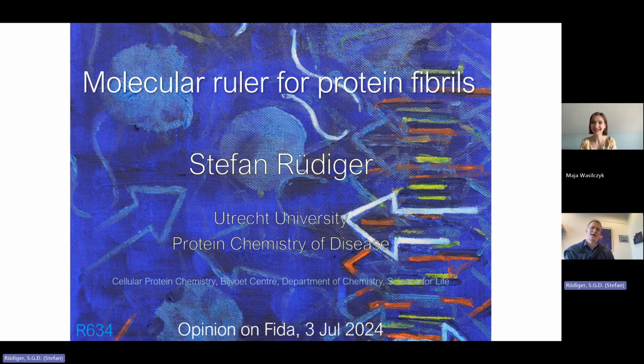Thank you, Maya. My laboratory is working on protein folding and aggregation and the protein quality control system controlling protein aggregates. And that is the application we use FIDA for. And I would like to briefly illustrate that in a short presentation.